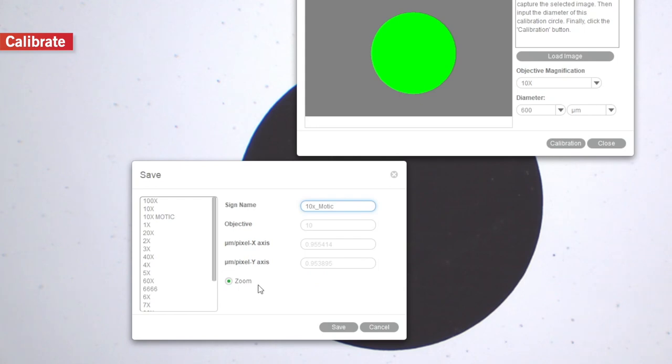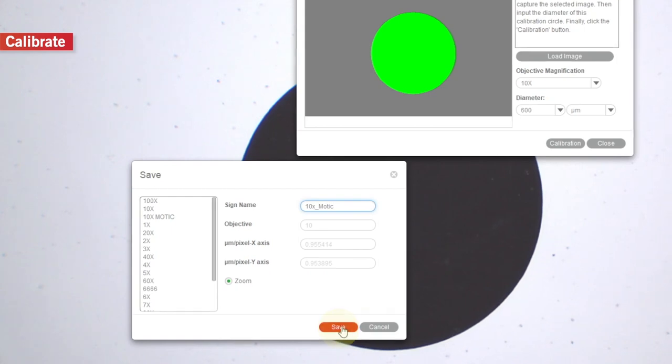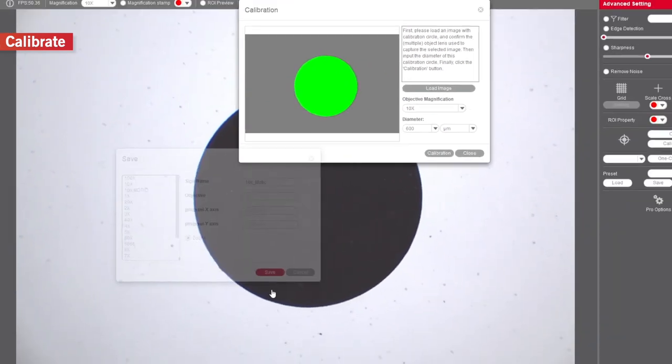Make sure you have ticked the zoom checkbox. Then, click on the Save tab to save the calibration.